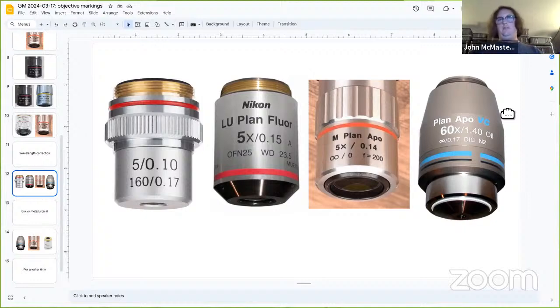You want a large field number to see more of the wafer or the cell or whatever. All of these play together, because you could take even a lower grade objective and restrict the field number on that. Maybe it's apochromatic and plan in just the center of that objective. But as you expand the field number, it gets more difficult to grind the lenses precisely, and the grading goes down. So it's a trade-off of how wide a field of view you want and how well corrected you want it to be within that field of view. Very cool. Yeah, that makes sense.